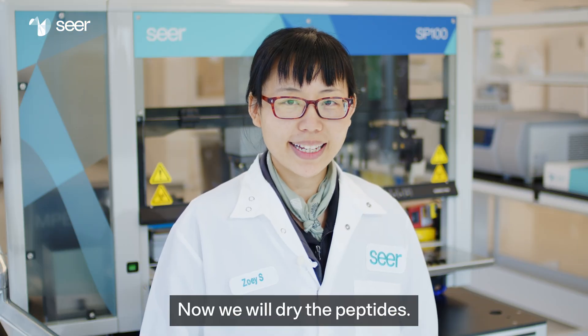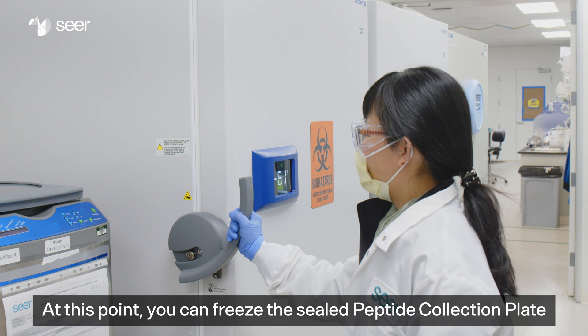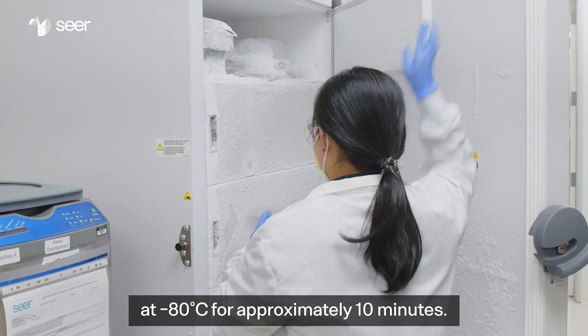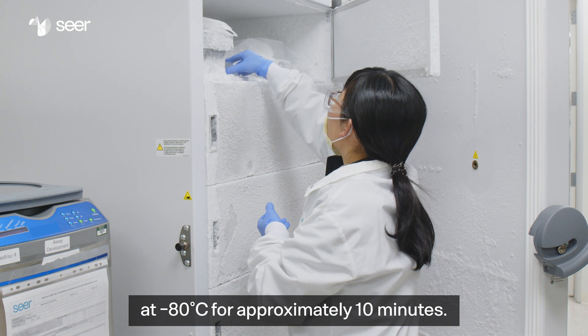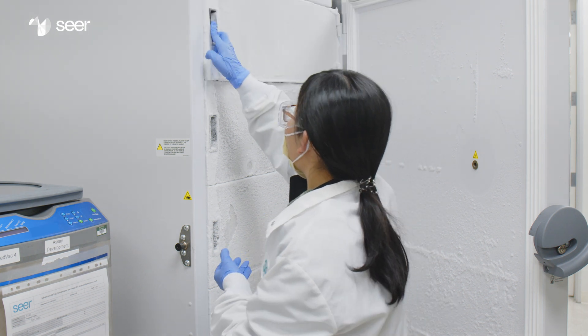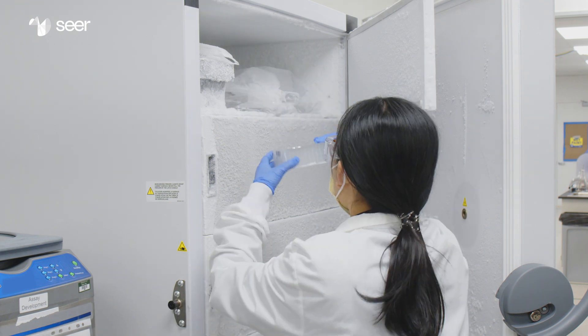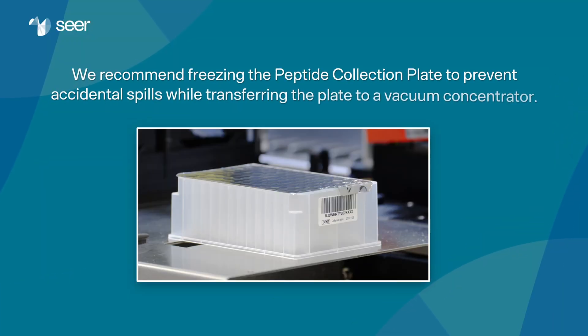Now we'll dry the peptides. At this point, you can freeze the sealed peptide collection plate at minus 80 degrees Celsius for approximately 10 minutes, then remove it from the freezer. We recommend freezing the peptide collection plate to prevent accidental spills while transferring the plate to a vacuum concentrator.